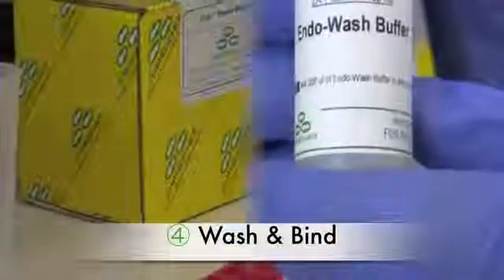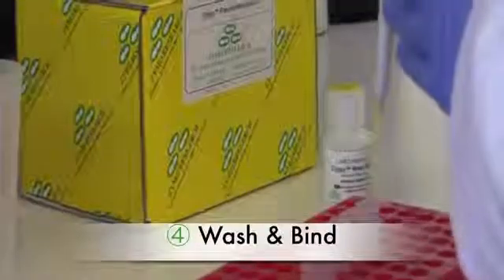After passing through the supernatant, wash with 200 microliters of endowash buffer, followed by 400 microliters of Zippy wash buffer. Finally, elute with at least 30 microliters of Zippy elution buffer.